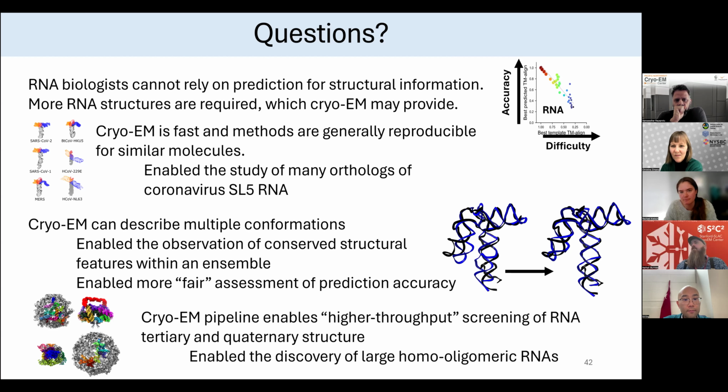Cool. The next question is dealing with contrast. From the questioner's perspective, in many of the RNA maps, the strongest signals are coming from the base pair interactions and not necessarily the phosphate backbone. I'm wondering if you had an explanation for this, or thoughts on why you get more contrast from the base pair and not the highly charged backbone.